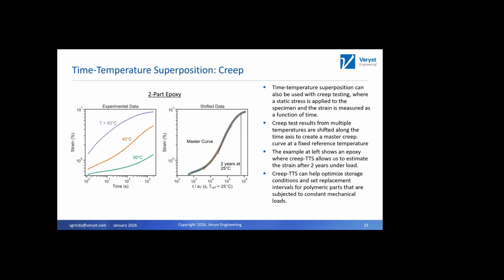Because you can imagine that if we sorted all these data points by their time and then drew a line between them, we would jump from here up to here, down to here, up to here, down to here, down to here, and the length of that line would be very long. As we shift these on top of each other, and as we get a nice superposition master curve, the length of that line is much shorter. And so that's effectively how these algorithms work.